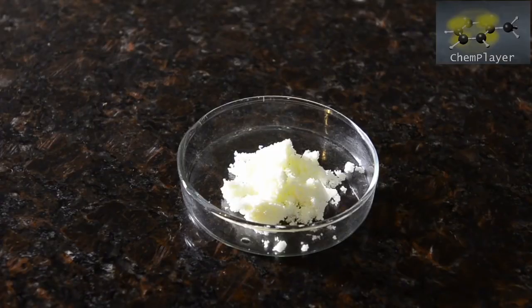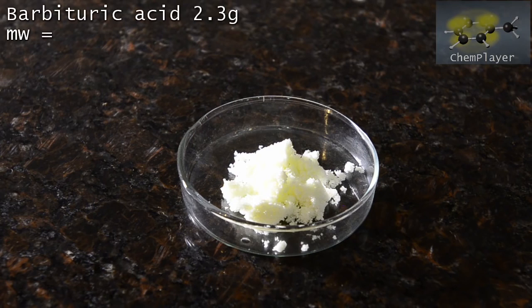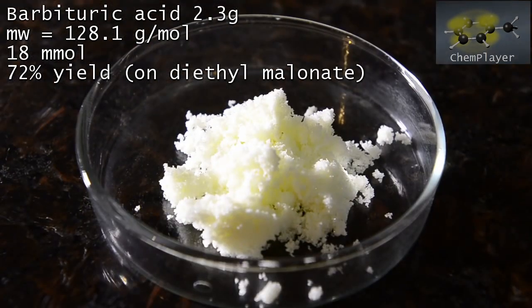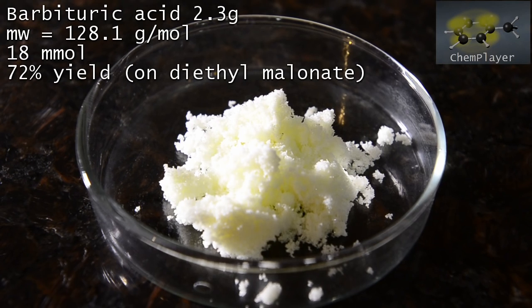Here's our dried product. 2.3 grams of fluffy cream-colored tiny crystals of barbituric acid. Barbituric acid is colorless, so this will need recrystallization to obtain a completely pure sample. This is a crude yield of 72%, which is about the same as the literature suggests, and this is a great result as it shows our drying precautions worked well.